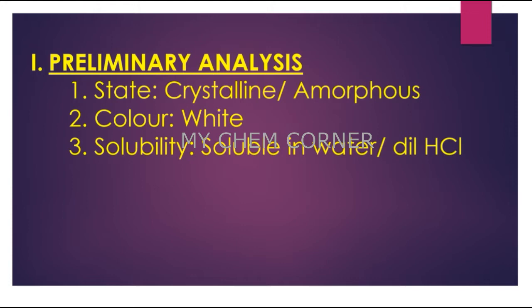The color of the salt is always white. We don't give any other salts. No colored salts will be given to you except for one that looks pale pink in color, but the majority of your salts are white in color. As for solubility, if it's a crystalline salt, it has to be soluble in water, and if it is an amorphous salt, it will be soluble in dilute HCl. So accordingly we can write it.